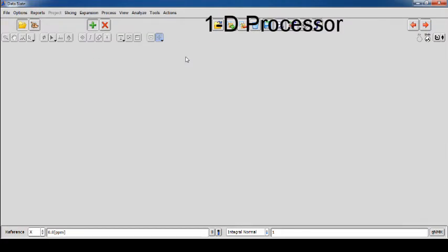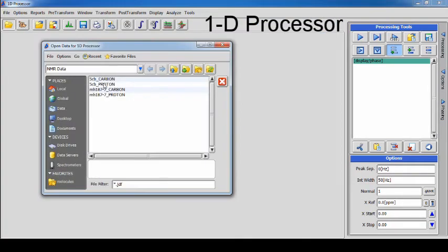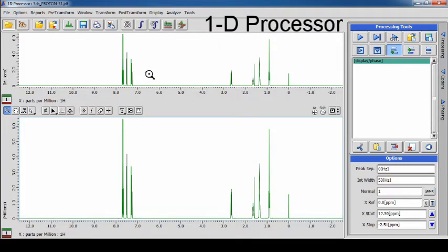The 1D processing window is a much more in-depth and detailed version of the dataslate, which can be accessed by using the Process drop-down menu and clicking Process 1D NMR. It has a few more features than the dataslate, such as compute and show statistics. This automatically sets the thresholds of the baseplane, noise, and peaks, and auto-phases the spectrum, which predicts the best phasing to use.